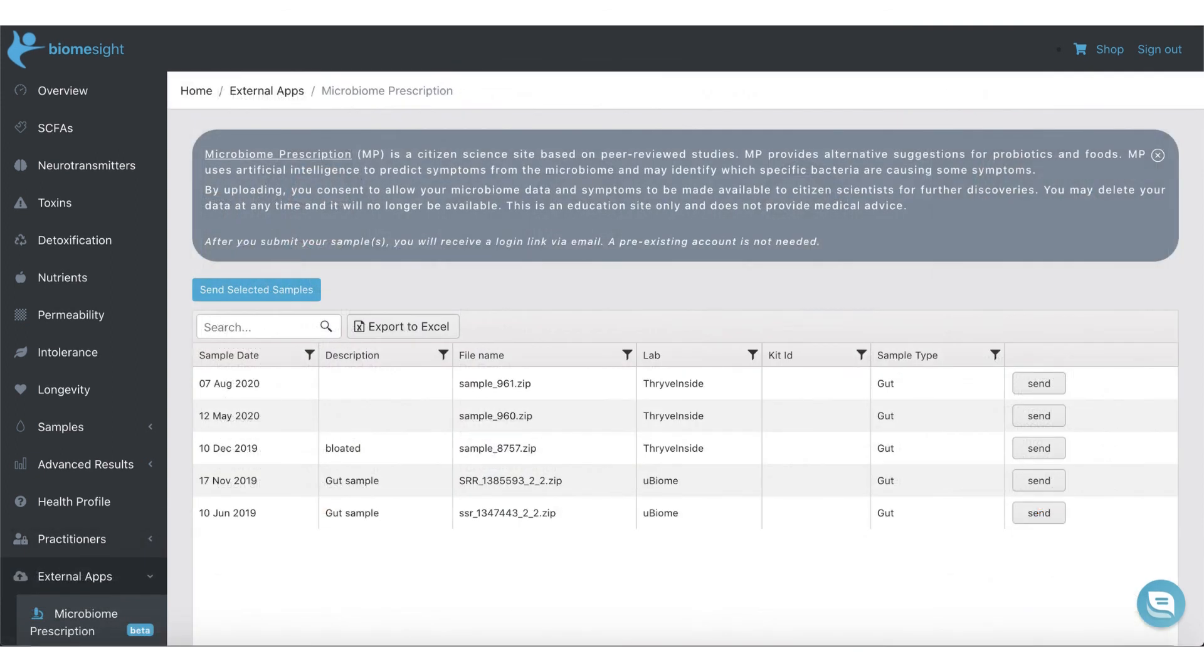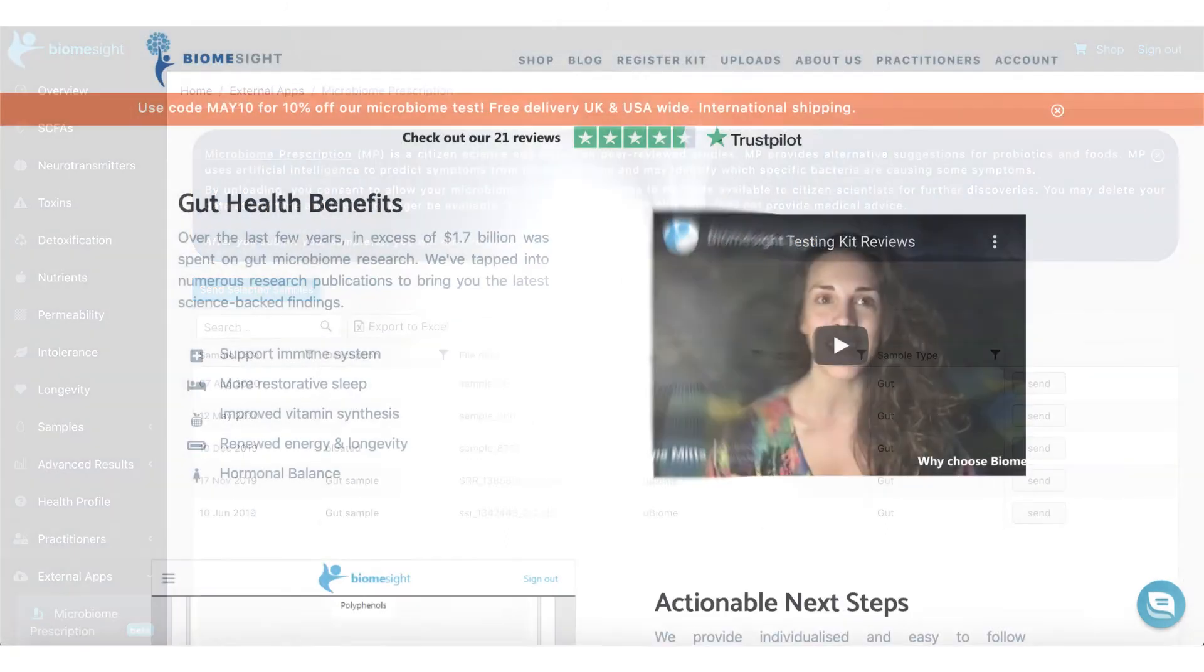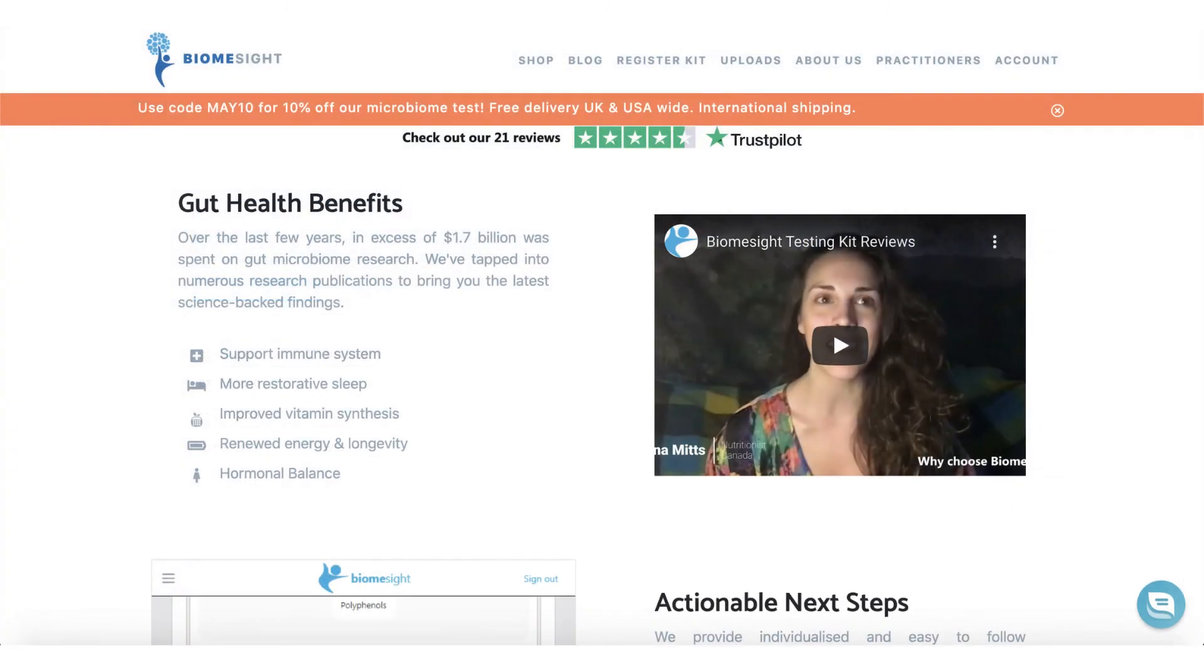If you would like additional insight into your results, you can also send your data to our partner site, Microbiome Prescription, using just a single click. If you'd like to try one of our tests, please head over to biomesight.com to find out more.